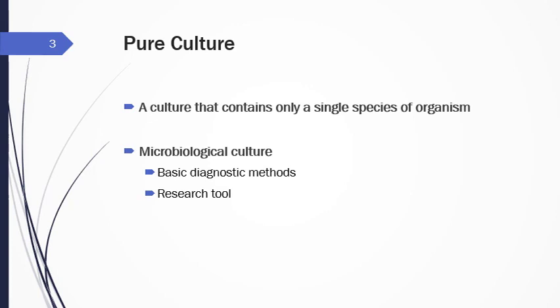A microbial culture or microbiological culture is a method of multiplying microbial organisms by letting them reproduce in a predetermined culture medium under controlled lab conditions. Microbial cultures are foundational and basic diagnostic methods used as a research tool in molecular biology. Microbial cultures are used to determine the type of organism, its abundance in the sample being tested, or both. It is one of the primary diagnostic methods of microbiology, and it is used as a tool to determine the cause of infectious diseases by letting the agent multiply in a predetermined medium.